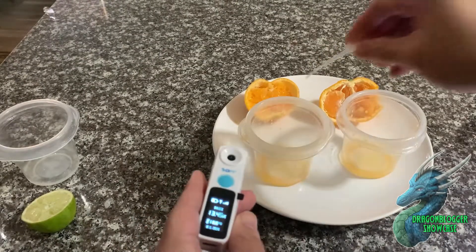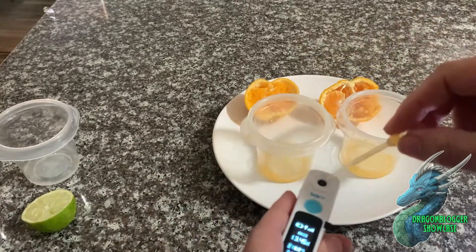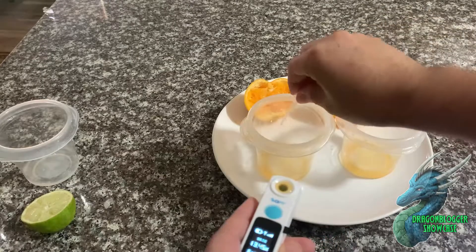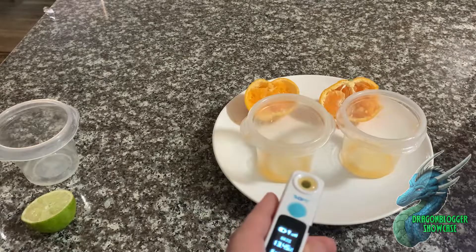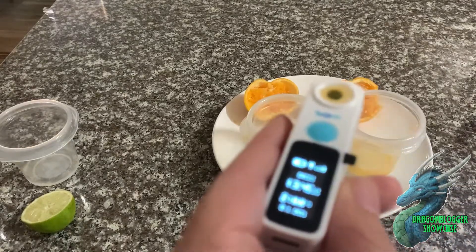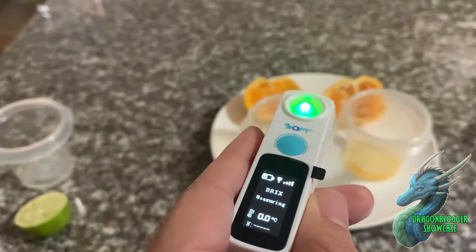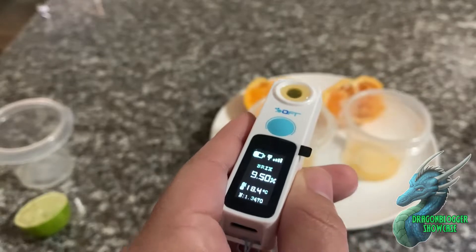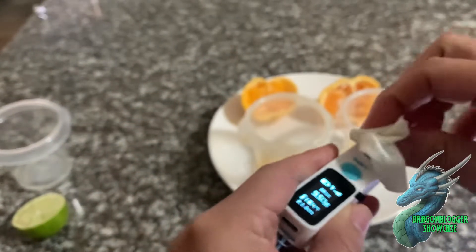Now that my pipette is clean I'm going to take some juice out of the left satsuma, cover the sensor completely, empty it out, and clean my pipette again so it's ready for the next one. Let me make sure I focus the camera so you can see the screen — I'm going to press the button. It's measuring. This one on the left is 9.5 percent Brix.